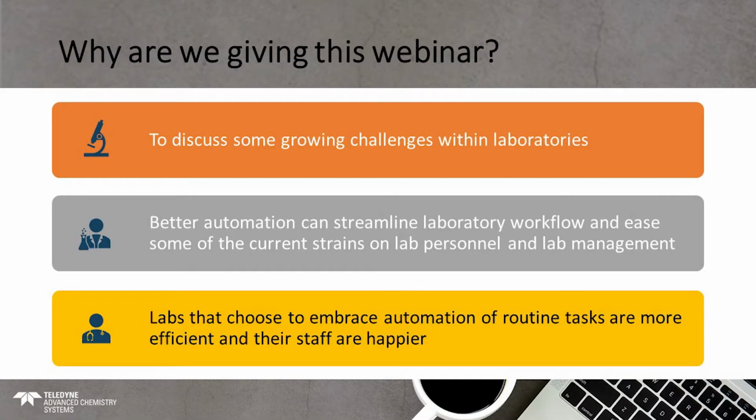Before we dive into it, I want to start by asking a question and discussing why we're giving this webinar in the first place. I want to discuss some of the growing challenges within laboratories, because I think it's important that lab managers hear that they're not the only ones facing these kinds of trials in their workplaces, and also because better automation can streamline our laboratory workflows. It can ease some of the current strains on lab personnel and lab management.